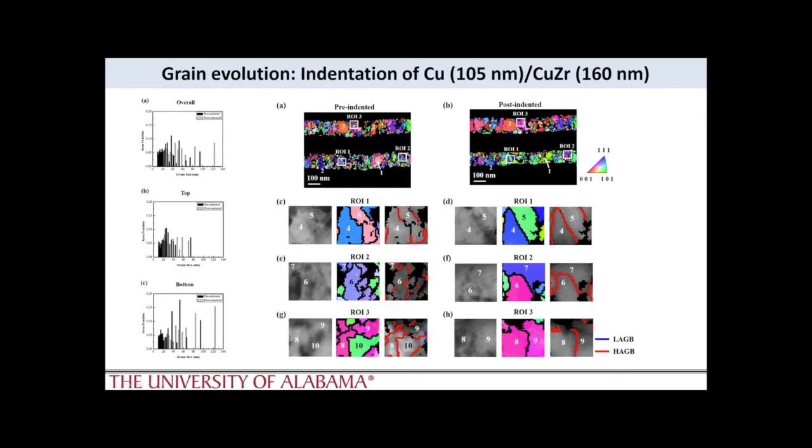And I can even, again, notice that grain 6, which has this bluish purple color orientation, now has gone to this pinkish red color, indicating, again, a rotation mechanism along with some form of grain growth under mechanical deformation. So even though mechanically induced grain growth has been observed prior to this, most of that work has just been able to quantify, okay, this grain grew, but here we're able to correlate that with its texture and the boundary structures that it forms.